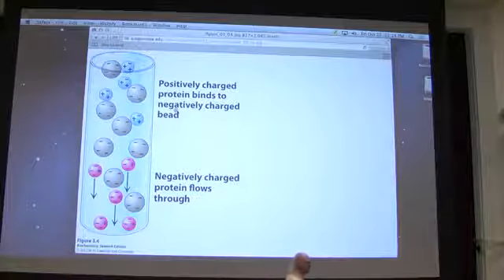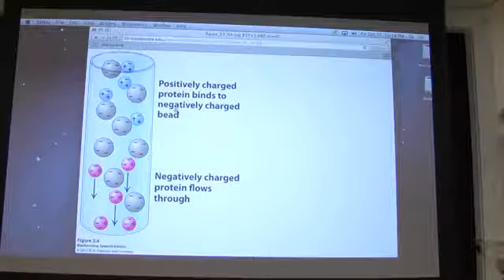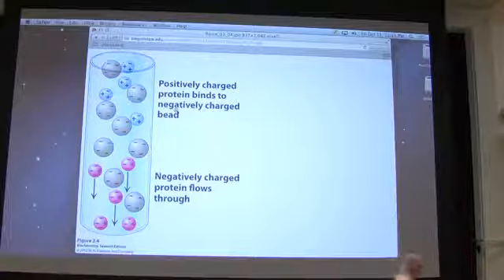Ion exchange chromatography also uses little tiny beads, just like gel filtration chromatography, except the beads that we use here do not have any holes in them. So no holes. Instead, the beads have molecules attached to their surface that have a charge.